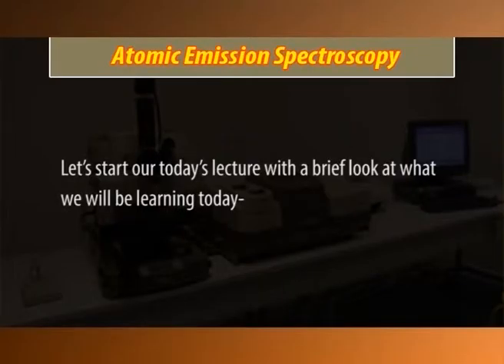Recall that in the last lecture, we studied about the atomic absorption spectrometry technique, its principle, methodology, instrumentation and applications. Let's start today's lecture with a brief look at what we will be learning today.